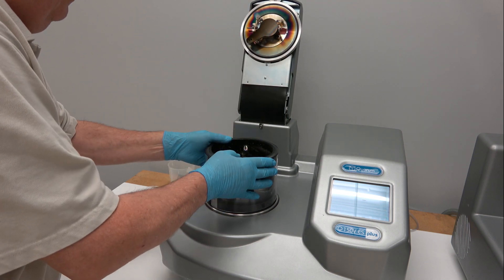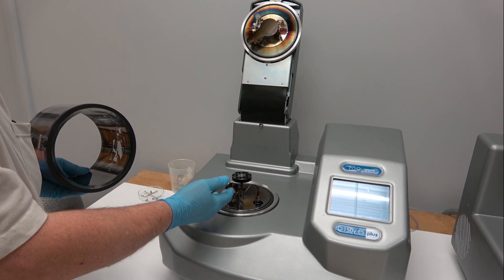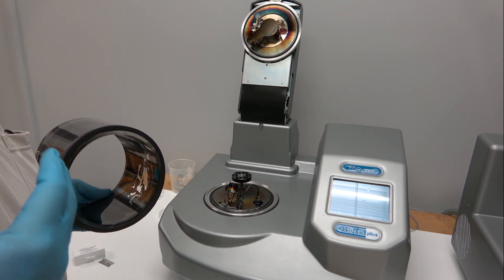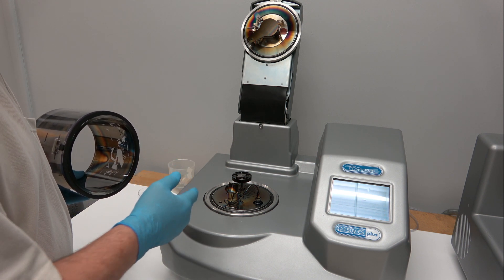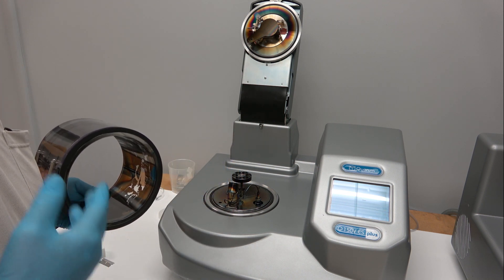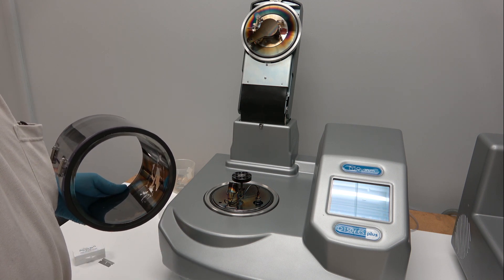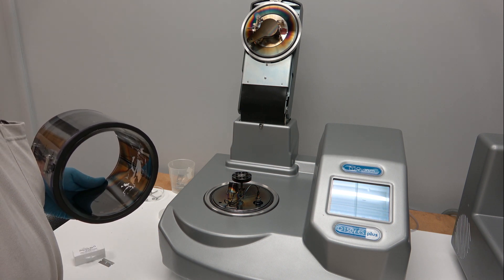Inside we have the film thickness monitor. When you're doing pulsed carbon rod, the film thickness monitor is not able to measure because it gets heat shocked — the crystal expands, changing the frequency at which it oscillates, and causes errors in readings.